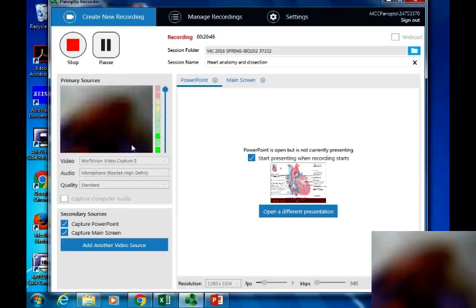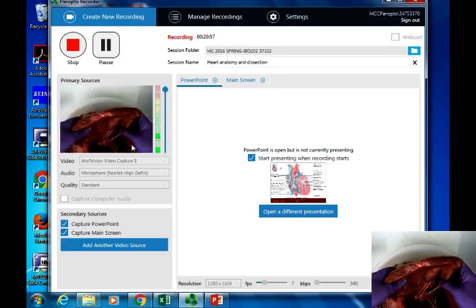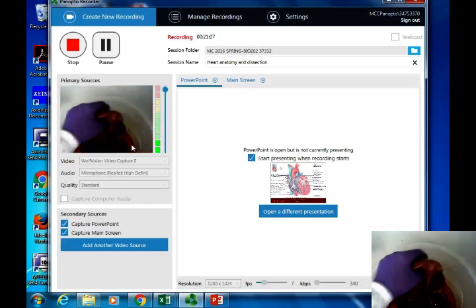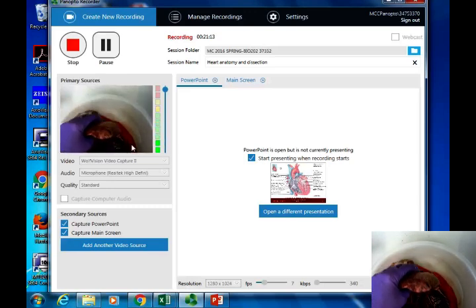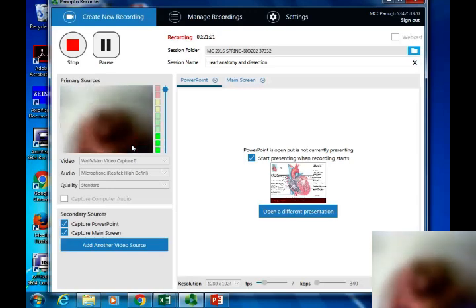And then this, that's your AV valve right there. That's the other one, the one that's small here. And these are just anchored along this side. So there's a small individual one on this side. For the AV valve, yeah, so it's going to go up here. So this is the atrium up here. It's going to pass down, and the atrium contracts and closes, if you will, and allows it to go down here. And then it's going to go this way and head out the aorta instead. Right there. So that's that arch. The arch is going to be going around through the base.